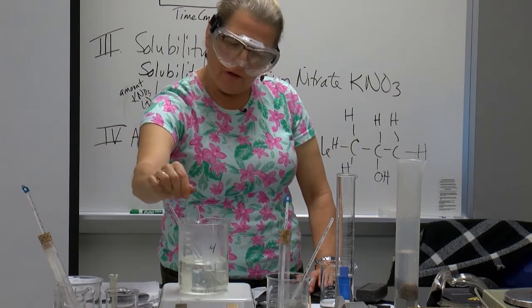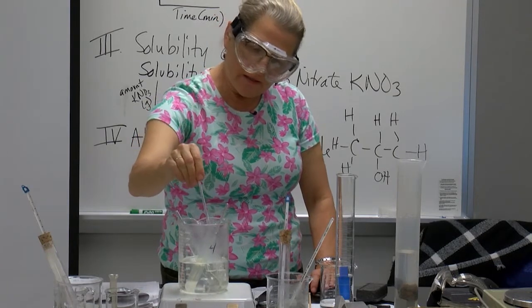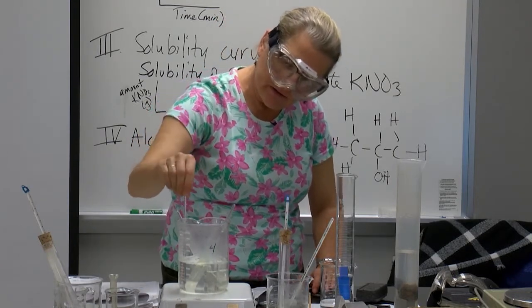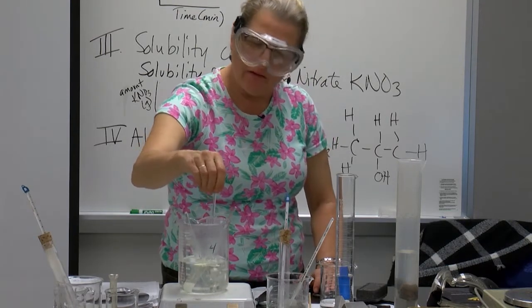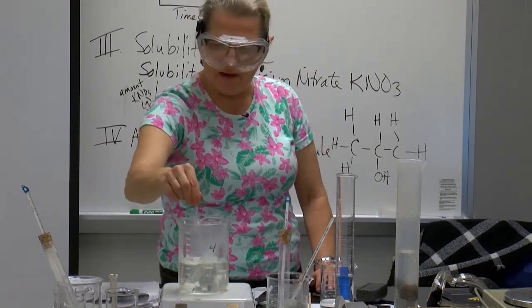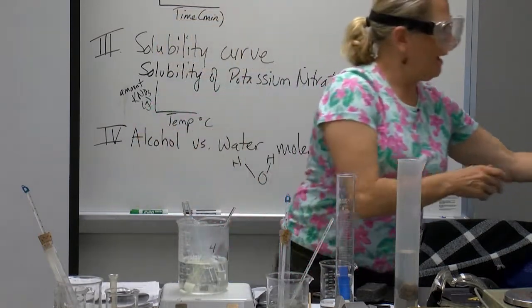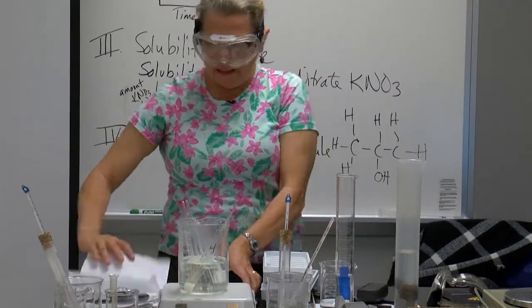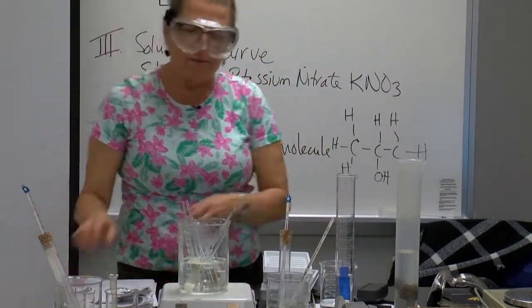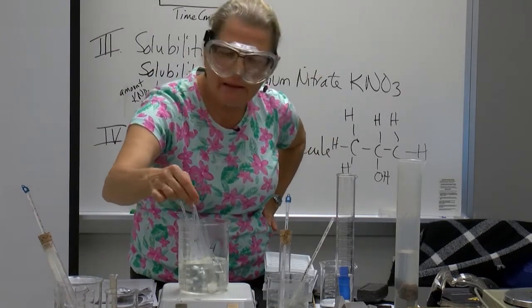So what we're going to do is, when this is all finally dissolved, we're going to take it off the heat. The 3 and the 5.5 are good. The 10 is almost good. And we are now working on the 15.